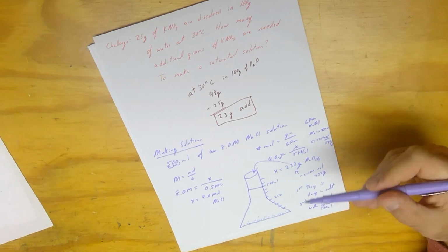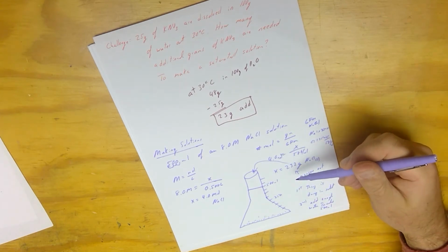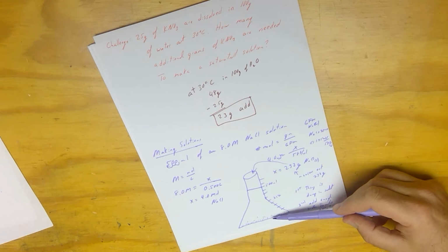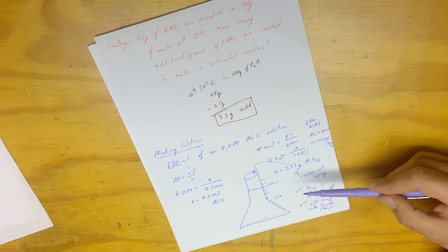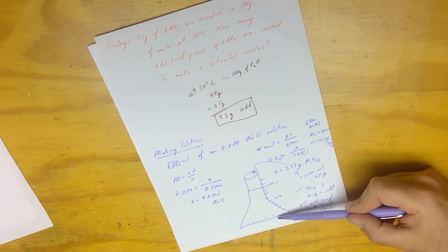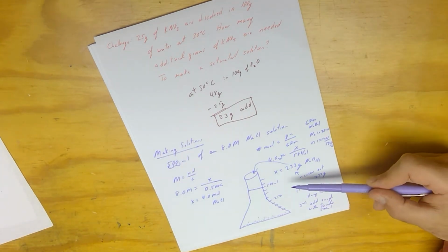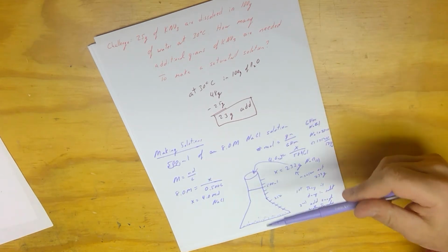Now, here's a question for you. Why don't I add 500 milliliters of water first and then dump in the salt? Well, remember, this salt does dissolve, but it still takes up space. If I put exactly 500 milliliters of water in first and then add my salt, the water level is going to be above 500 milliliters, and it won't be an 8 molar solution anymore. So we add the solid first, and then we slowly add the water, mixing as we add it so it all dissolves, until we get to the 500 milliliter mark. And this would be 500 milliliters of an 8 molar NaCl solution. And this is how we do it.